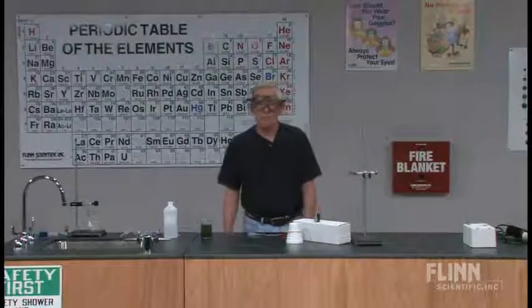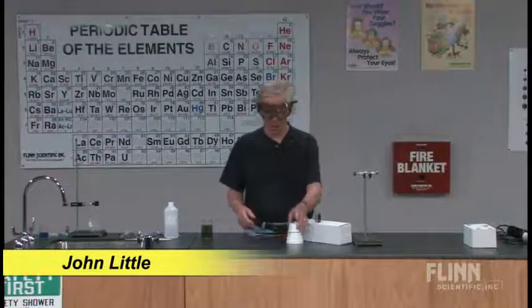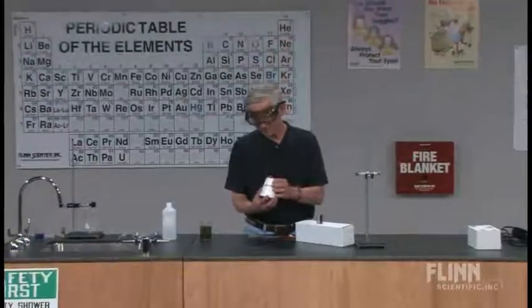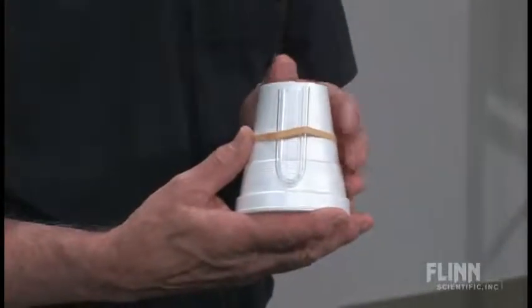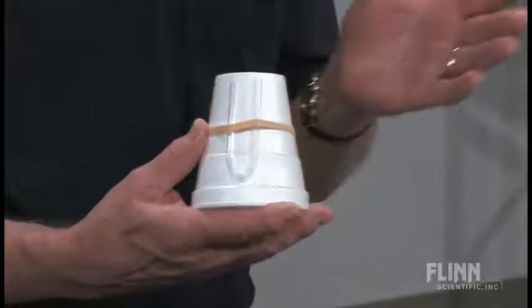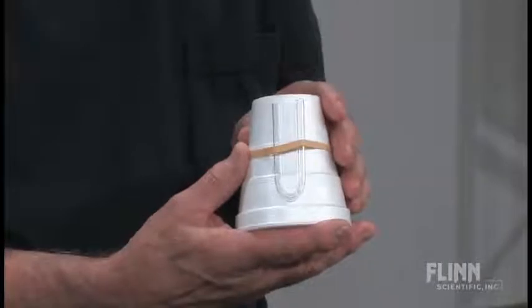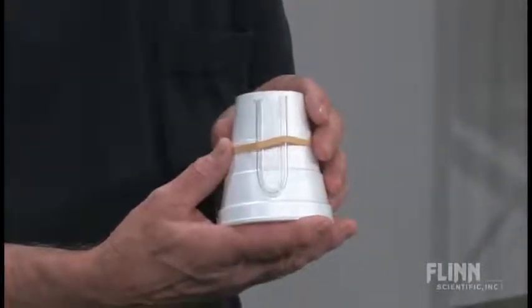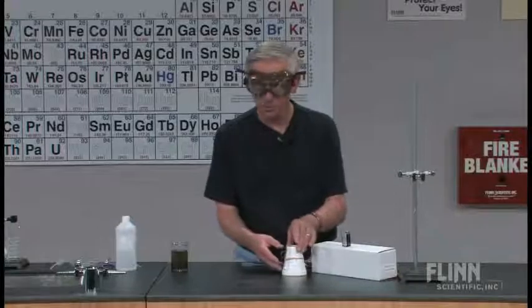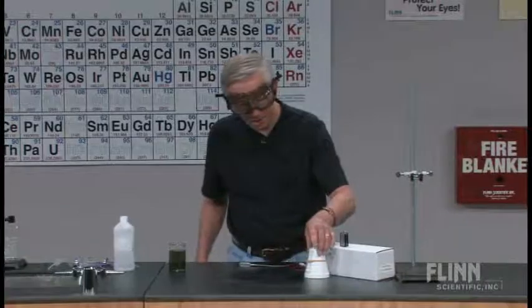I want to look at the electrolysis of water today, and I want to do that on a small scale. I've got a U-tube. You can have the student make these. You can make them yourself. If you're in a hurry some years and you have more time other years, you can very easily make them yourself and count on being able to use them for a long time. That's what I do. I'm going to put my solution in there, my water.